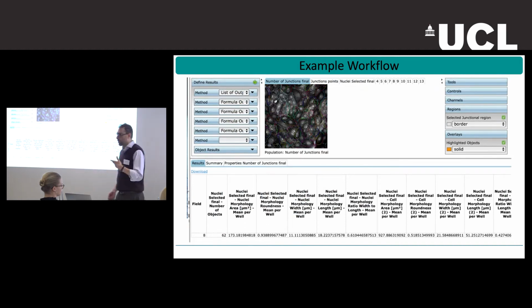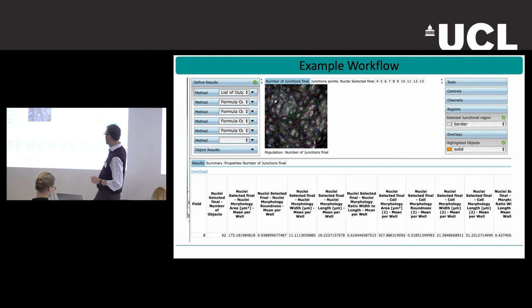The last step normally in this kind of analysis is telling the software that you're using to report all the numbers that we are using for understanding, for quantifying this or that. And you must always remember that computers only understand numbers, so they will always work on that. You can basically list as many parameters as you want as a result. Some can also be intermediate ones.